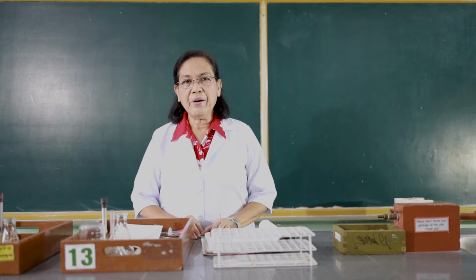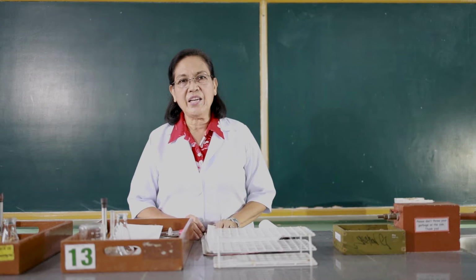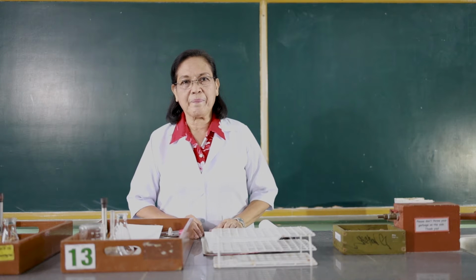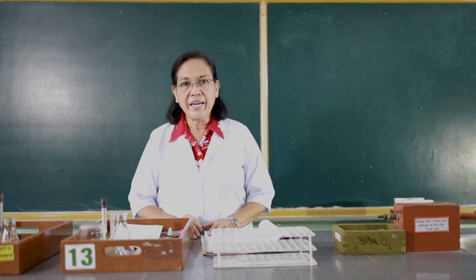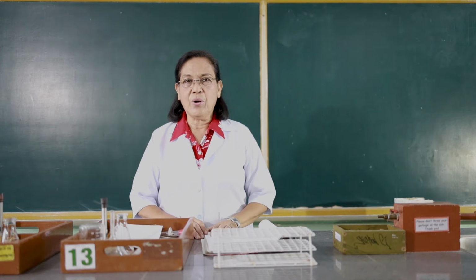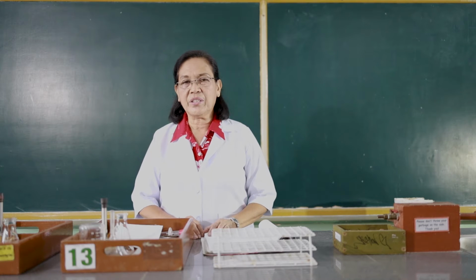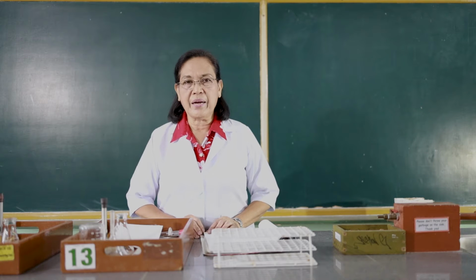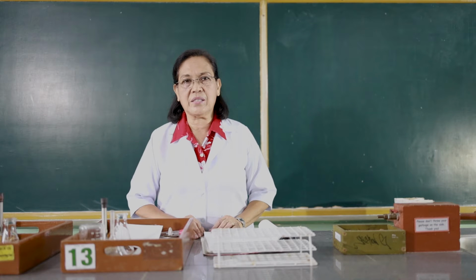Today, I will be performing and demonstrating to you the activity on hydrates and hardness in water. Now, what do we mean by hydrates? Hydrates are salts or substances which contain water molecules. And the hardness in water is due to the presence of calcium and magnesium salts like chlorides and carbonates.